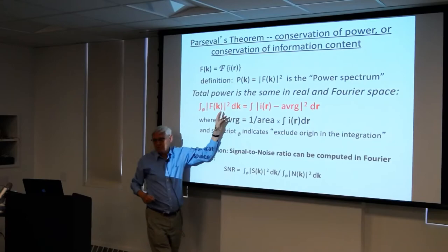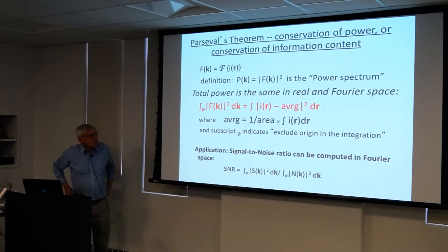Can I ask a question? Yeah. Why do we have to square it? Well, because we're interested in the variance.